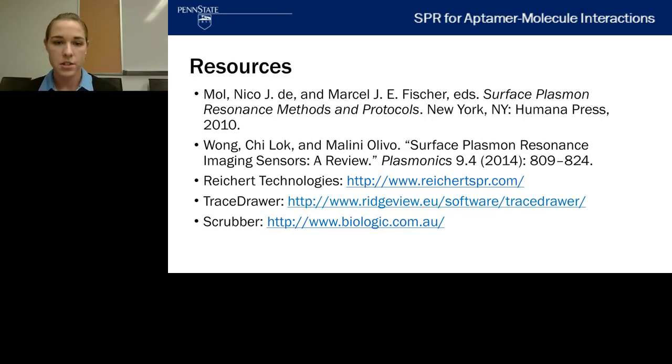If you're interested in learning more about surface plasmon resonance and the fundamentals of this process, these are some resources I recommend, the first two bullets. Additionally, if you see the use of SPR in your future, I would recommend looking at Reichert Technologies, which is the system that we use. Also, for the analysis software, I would recommend looking at TraceDraw, which is associated with Reichert software, and also Scrubber, which is another data analysis software.